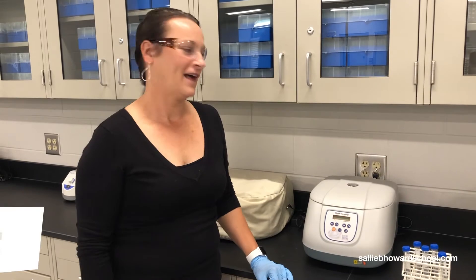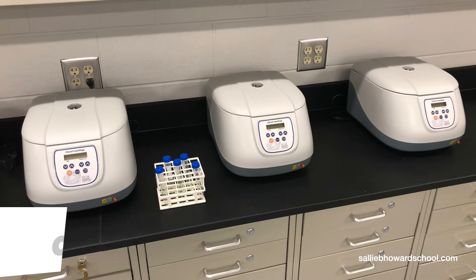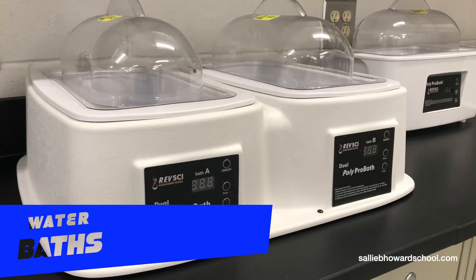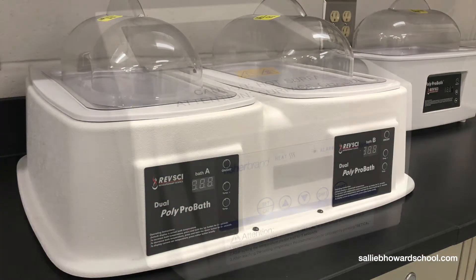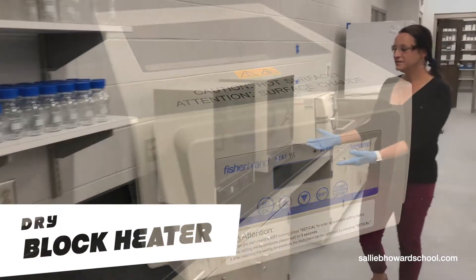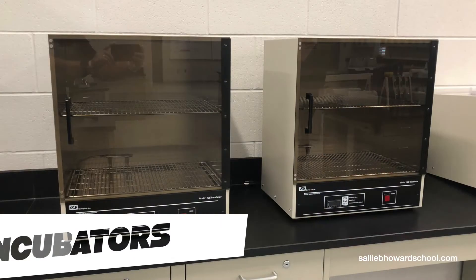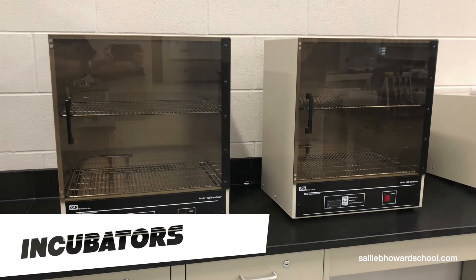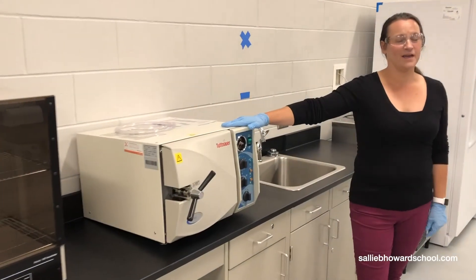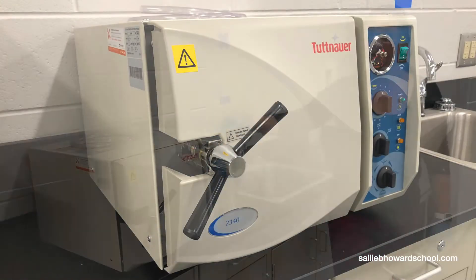Moving along in our lab, we have three centrifuges, a few water baths, and we also have our dry blocks. Some days the students will use our incubators — some at 25 degrees, some at 37 — depending on what we're growing. We also have an autoclave, and we have more than one of these, but this is where we sterilize most of our equipment.